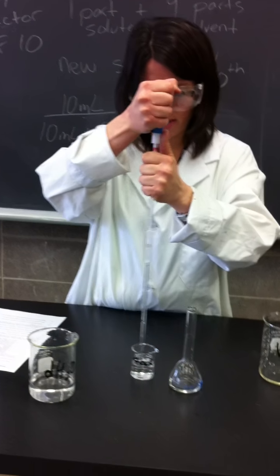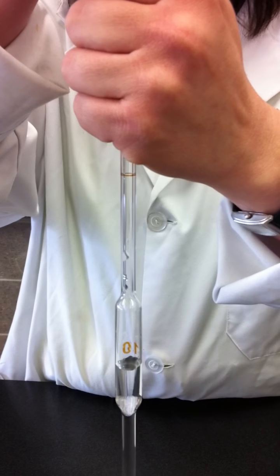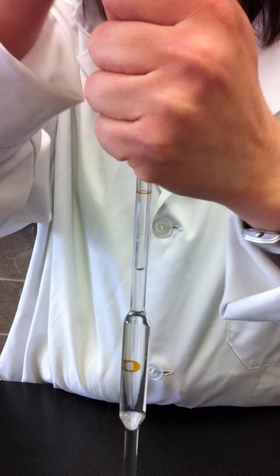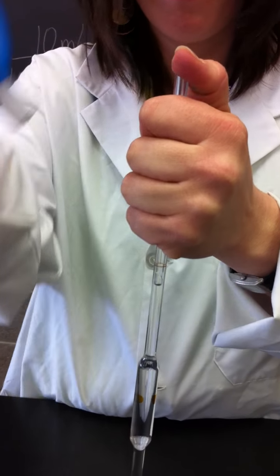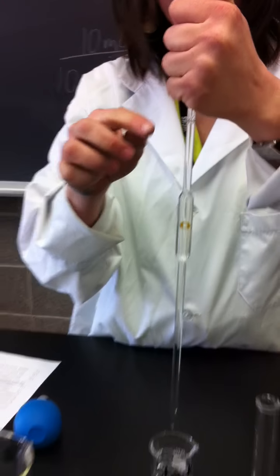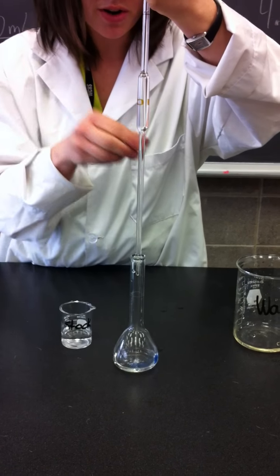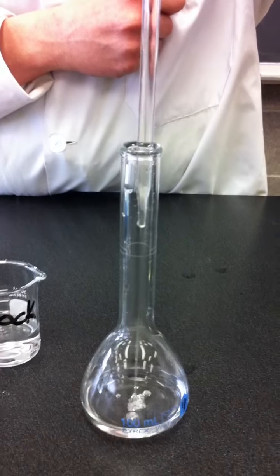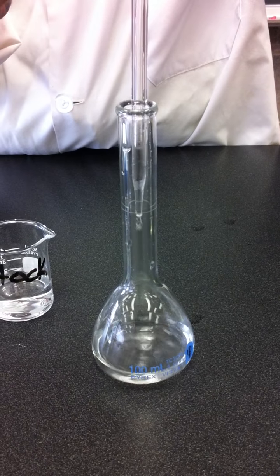All right, so I'm going to suck up 10 mils of my acid. Okay, so you can see your line there. Okay, so I'm right at the meniscus, and I'm going to let that go into my volumetric flask. I have a little bed of water in there for safety reasons. So just let it flow out nicely. Don't blow it out with the bulb. It's designed to keep a little bit in the tip.